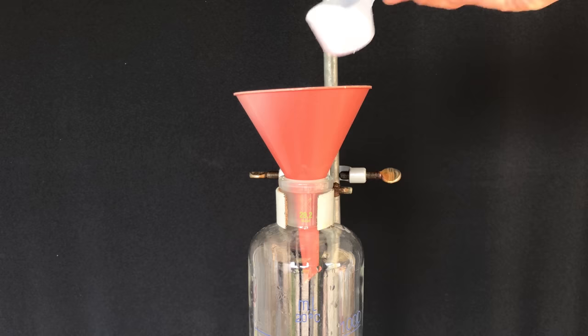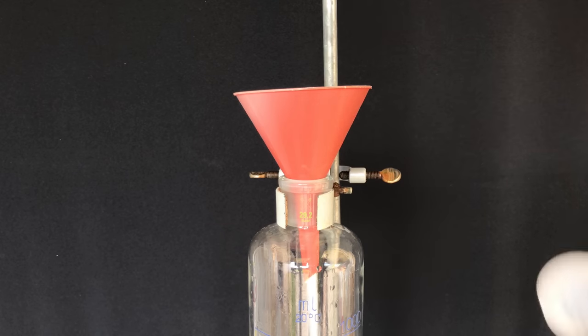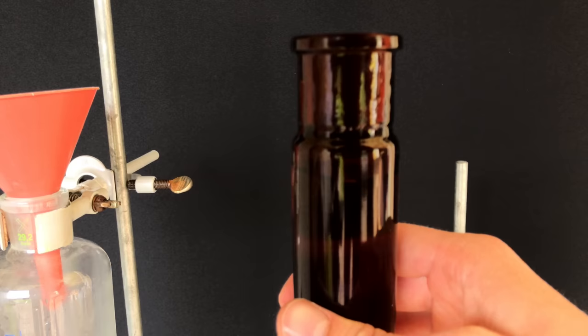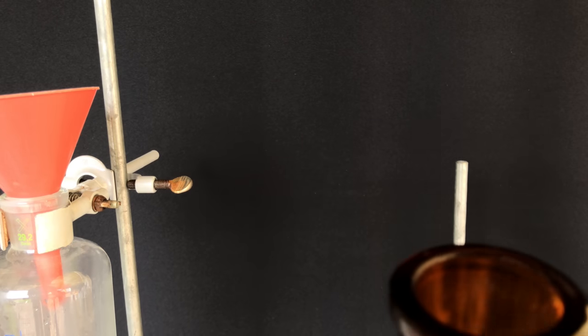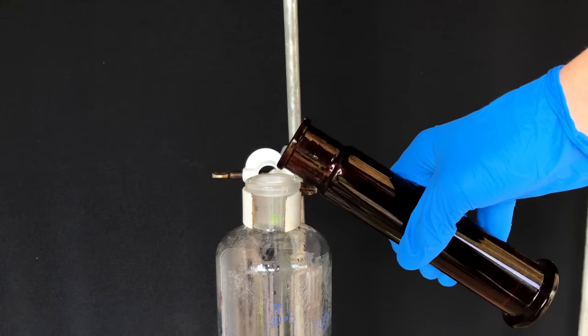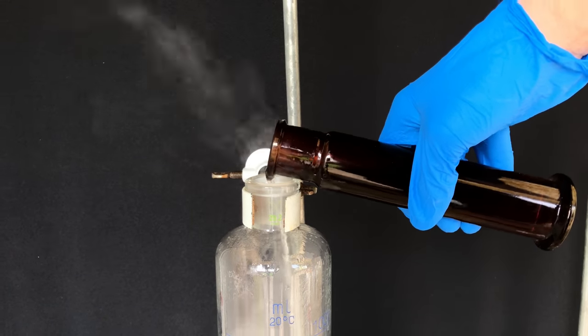After about half an hour, our silicon tube started leaking and therefore I stopped the hydrogen chloride generation. If it did not leak, I would have continued for about 20 more minutes. The contents of the gas washing bottle fumed profusely. This was due to dissolved hydrogen chloride.